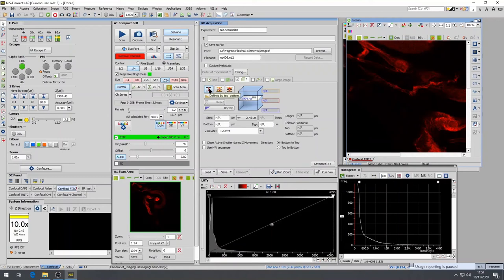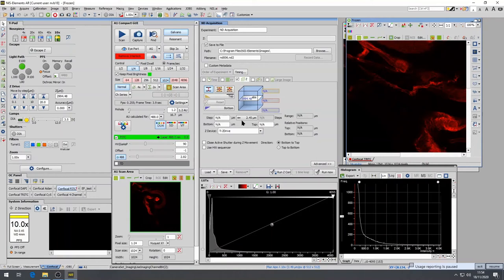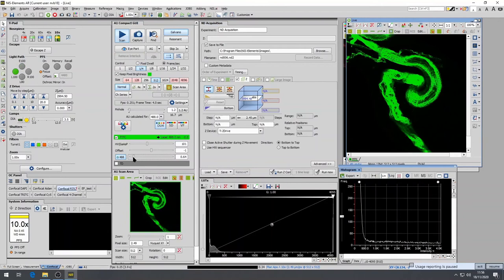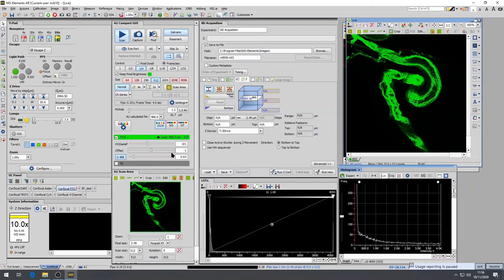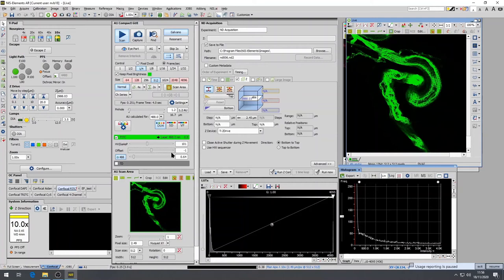Most users will want to define the top and bottom of their sample, so we will go through this configuration in more detail. Select the left-most Z-Stack icon, allowing you to define the top and bottom, and then select the appropriate Z-device. Deselect all of the different laser lines and channels within the A1 Plus Compact GUI, except for one. It is recommended that you leave the channel of most importance, or the one that you think will help you most to define the top and bottom of your sample. And then press Scan in the A1 Plus Compact GUI.